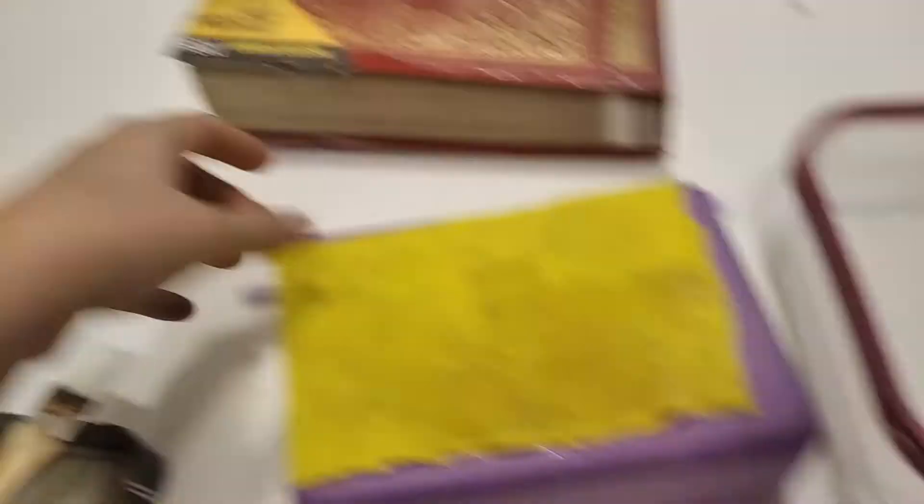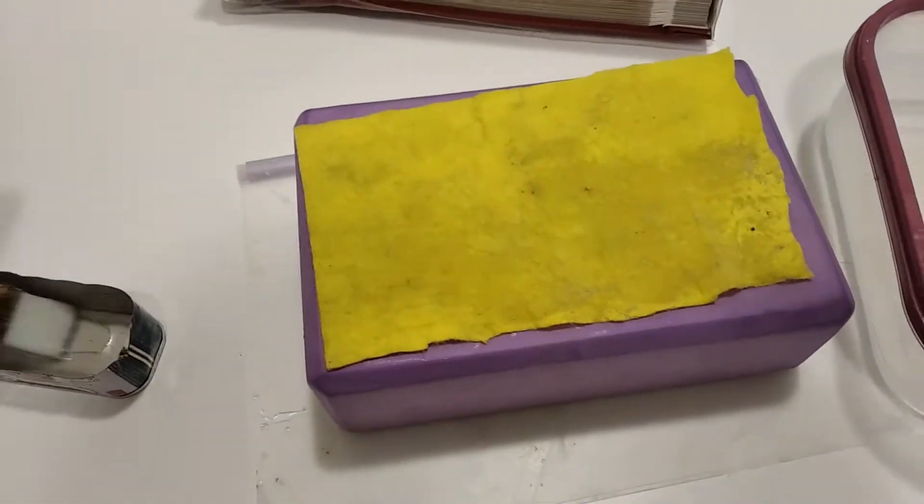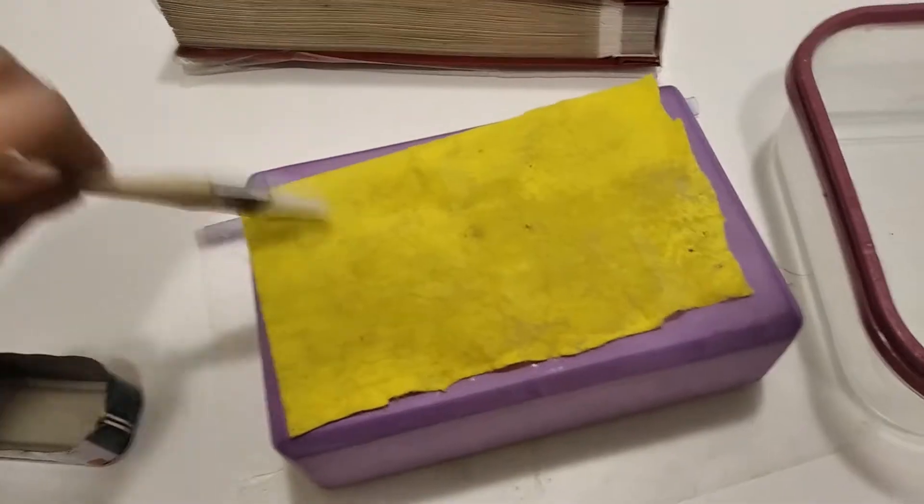Now the next step is to dunk it in the sodium hydroxide. Don't forget to do both sides because if you only do one side, the coating is not going to be even. Another massive waste of polymer, but okay.